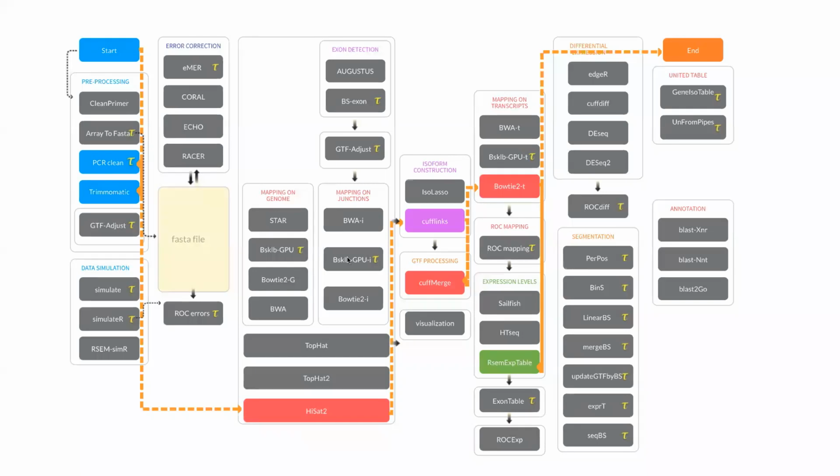Once we know that they have been spliced together, those could be constructed into isoforms. So we have a number of different exons, and that number varies between different isoforms. They're aligned together in specific ways, so we know what their order is, and we now can detect new isoforms.